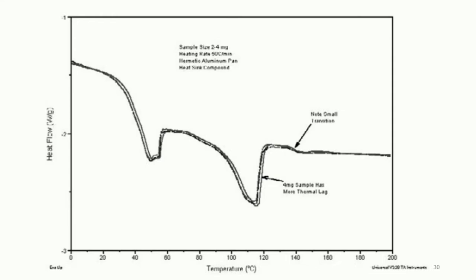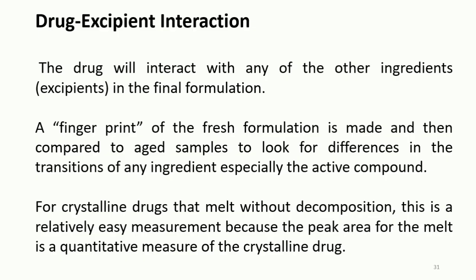So the next topic is drug-excipient interaction. Actual drug dosage forms are seldom just the pure drug or protein. Instead, they are usually composed of multiple ingredients that aid in the manufacture, storage, or delivery of the active ingredients.